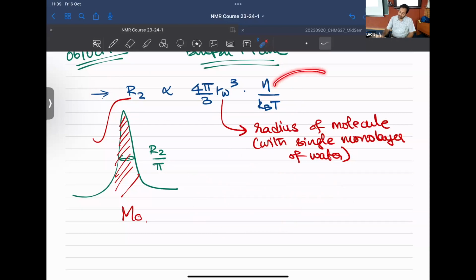So now the viscosity changes could also come due to solvent changes between H2O and D2O. So remember that. Go find out which has higher viscosity, D2O or H2O, and why. And the viscosity would in turn depend upon hydrogen bonding ability, and check whether D2O can form stronger hydrogen bonds within the solvent, or you're talking about hydrogen bonds across solvent and the solute. Solute here is the biomolecule. If the solvent can form hydrogen bonds within itself, then its ability to form hydrogen bonds with the solute reduces. So go figure out how things change. And therefore that will end up affecting the viscosity depending upon how much D2O you have to use.